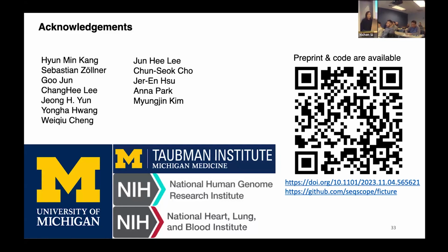Yeah, that's a good point. For this specific cell communication application, I think it is hard. I will argue that it's better if you have slightly more information about the cell morphology, because what we can achieve is, for example, conditional on the factors, seeing what genes are enriched at the boundary between factors.